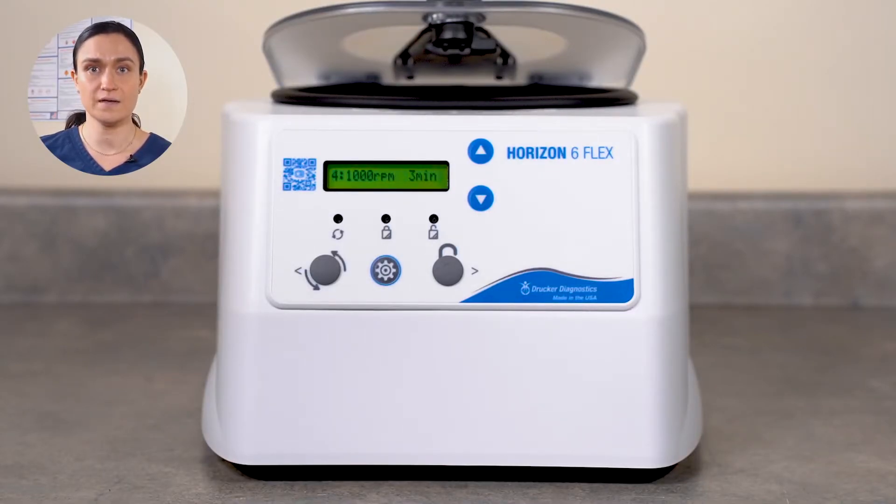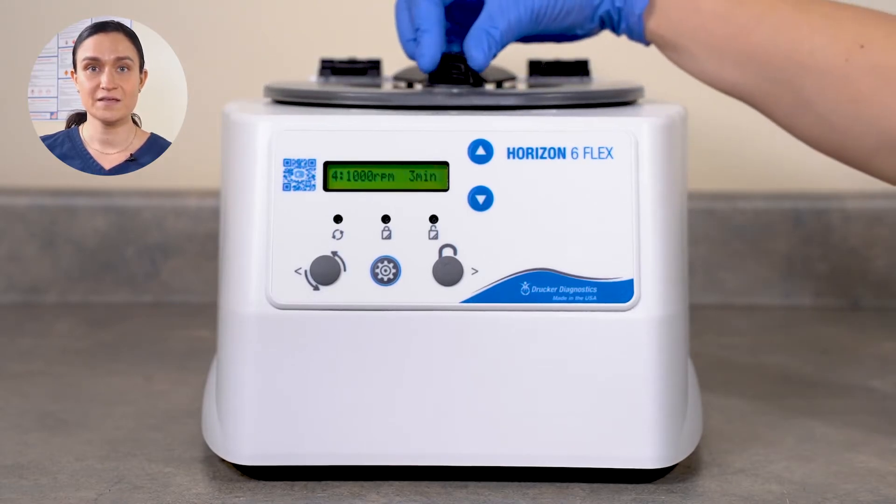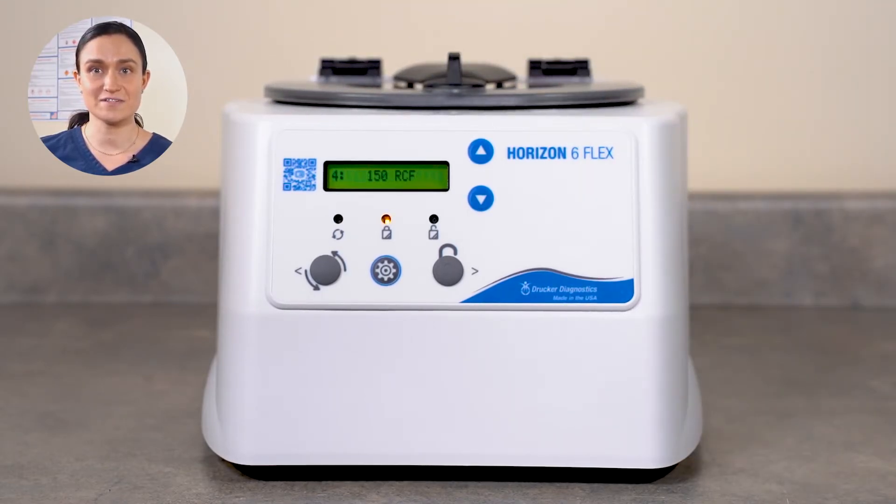If you see Preset Lock On instead, repeat the process until you see Preset Lock Off. Close the lid when finished. Your centrifuge is now back to factory standard operation.